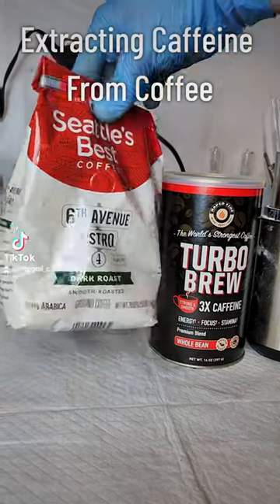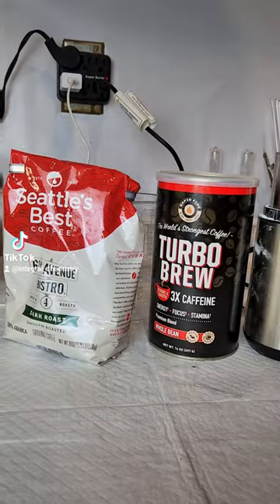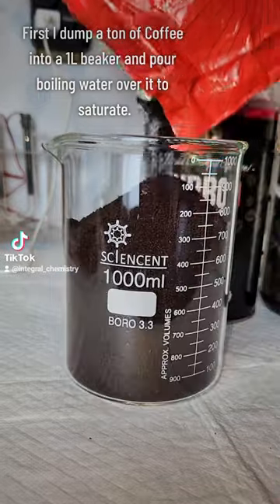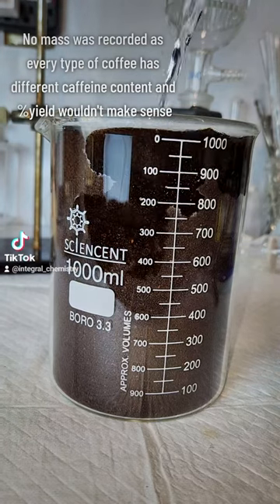I've had this coffee sitting in my pantry for like a year, and considering I don't really want to drink it anymore, I figured it could be fun to try to extract caffeine from it. To get started, I basically just want to make an extremely strong cup of coffee, and I do that by adding a bunch of the grinds to a 1 liter beaker and then dumping a bunch of boiling water over top.